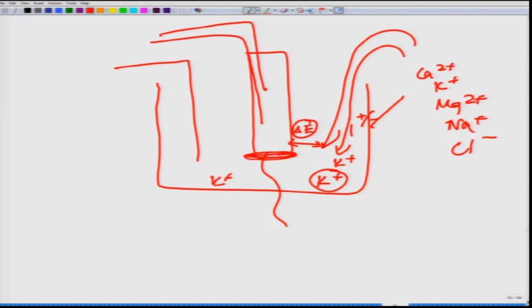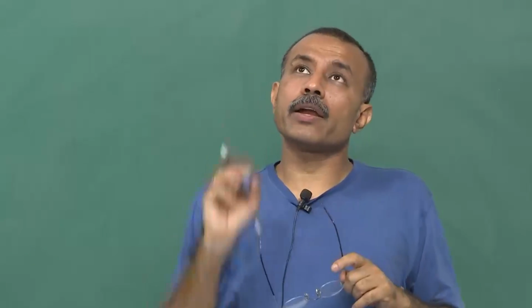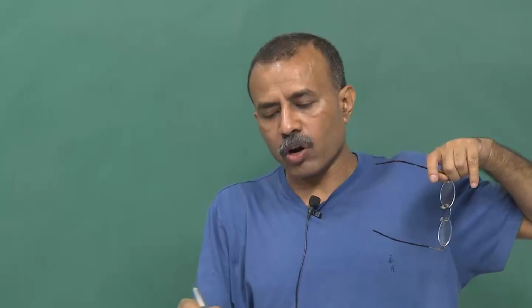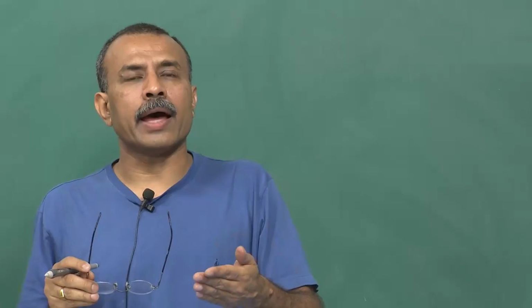and that is the key. In this case I gave you the example of valinomycin, a kind of cyclic peptide, which binds to potassium and ferries it inside the cell. If you coat the membrane with valinomycin, it will pull out the potassium ion, take it inside, and maintain an equilibrium. If you add more, it will ferry more. If it ferries more, there will be a concentration difference across this. Now, if you remember the concentration cell I taught, based on that you can always calculate the concentration of the analyte.